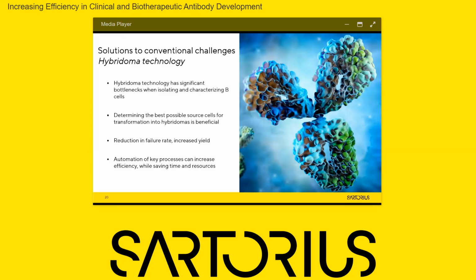It's also very important to increase the yield of your hybridoma while reducing the failure rate. So choosing B cells that are high producers but also are very robust will help greatly in this particular instance. In addition to all of this, the process of producing hybridomas is very time consuming and resource intensive. So automation of key processes would increase efficiency and save time and resources.